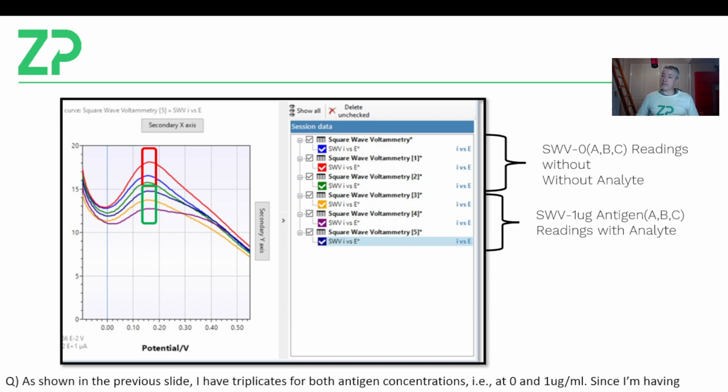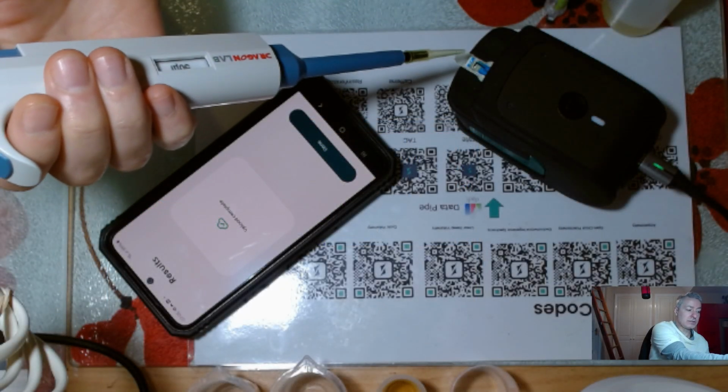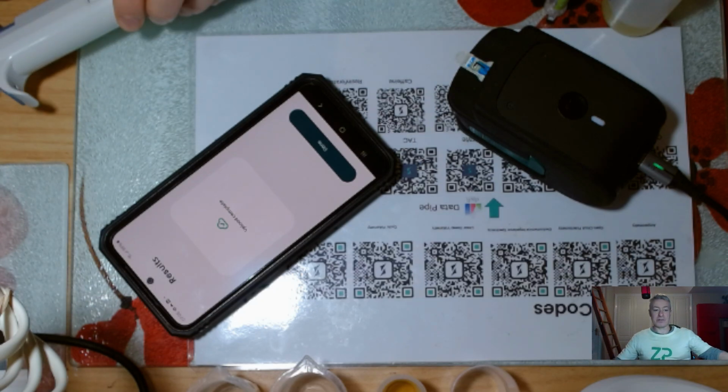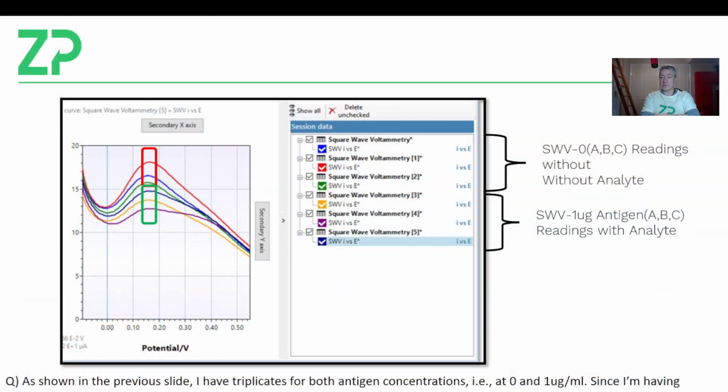And then the other part of reproducibility is actually the operator themselves. Are they able to bring solutions to electrodes in a repeatable manner? Is the sequence of starting the experiment exactly the same every time? I suspect that unless everything is controlled, reproducibility is a problem. So I suspect that their lack of reproducibility is a stacking of problems. It starts with the electrode, then the functionalization is probably not reproducible, then the test may not be reproducible. But in the end, they do get a signal.